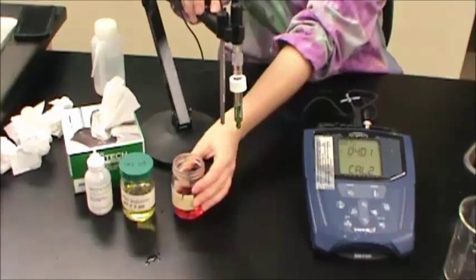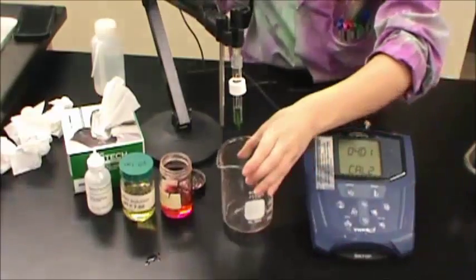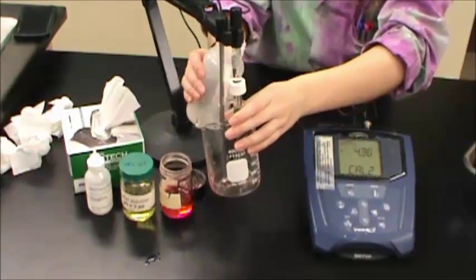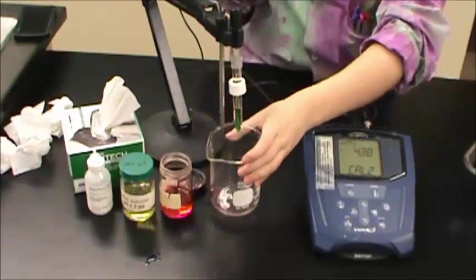The screen should now read CAL 2. Remove the electrodes from the first buffer solution and rinse them with deionized water and blot them dry before placing them in the second buffer solution.